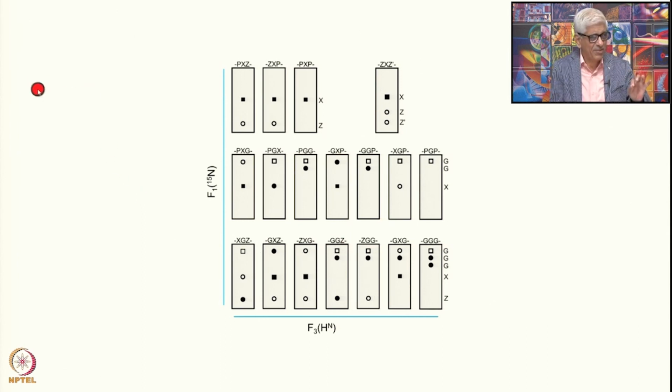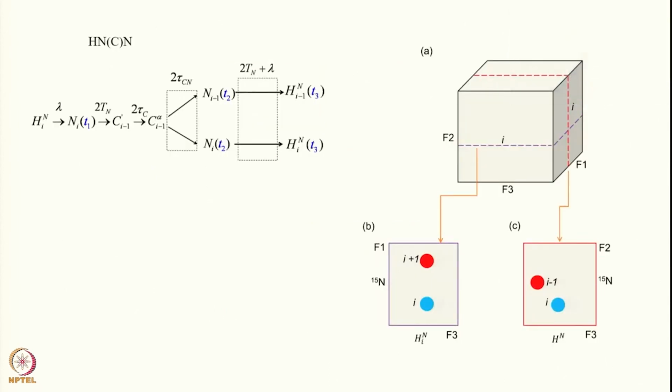You immediately identify, okay, are you doing the right thing or not? You go from one residue to another residue, and if you hit a glycine in the middle, then you must get these sorts of peak patterns, positive and negative combinations, and that will be extremely useful for rapid assignments of your polypeptide chain. Now there is another complementary experiment of this which is called HNCN.